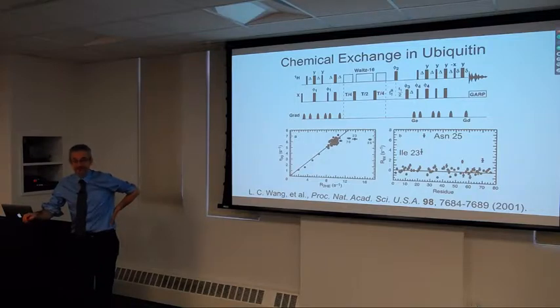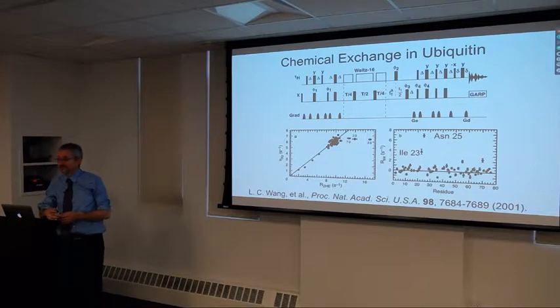Experiments to try to determine individual site-resolved chemical shift anisotropies in solution aren't very precise, so one usually ends up deciding that the error in the data is probably bigger than the variation in the CSA value, so that hasn't been so useful. And there's relatively few proteins in which site-specific CSAs have been measured by solid-state NMR.